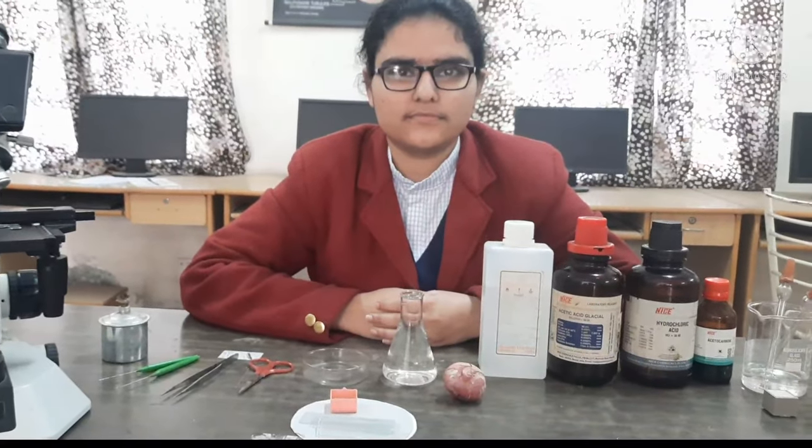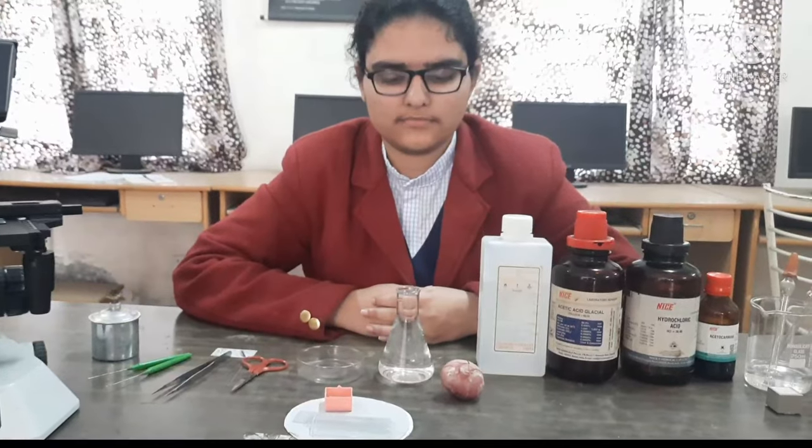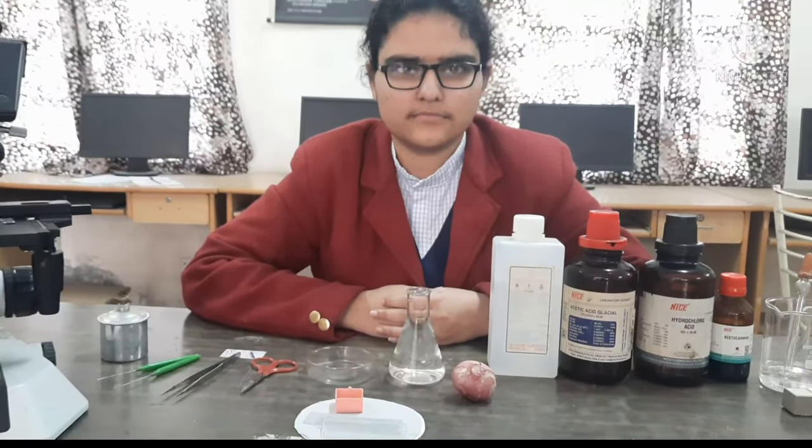Hello everyone, today my student Simranjit Kaur is going to perform one experiment to prepare a temporary mount of onion root tip to study mitosis.